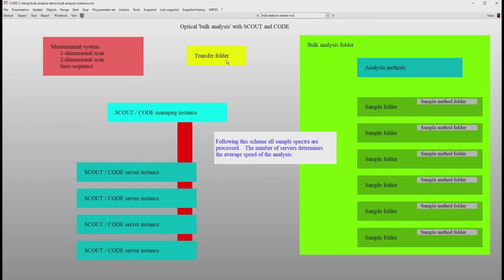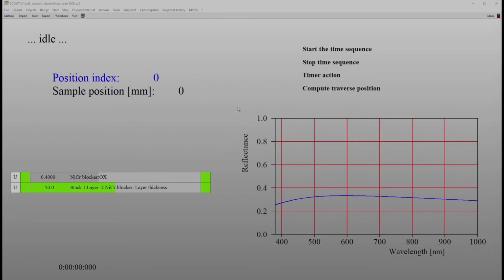Okay, let's start a demo system so that I can show you in an example how this will look in a real application. Here is a Scout configuration that you maybe recognize again. I have discussed its development in the video about automation and scripts.